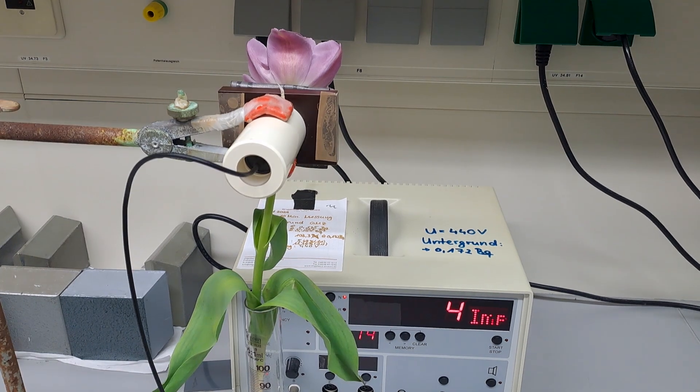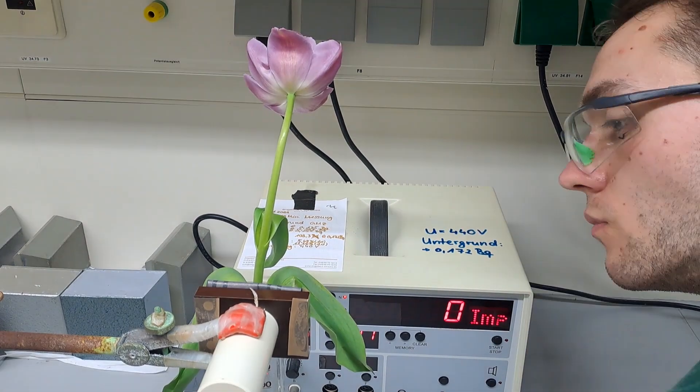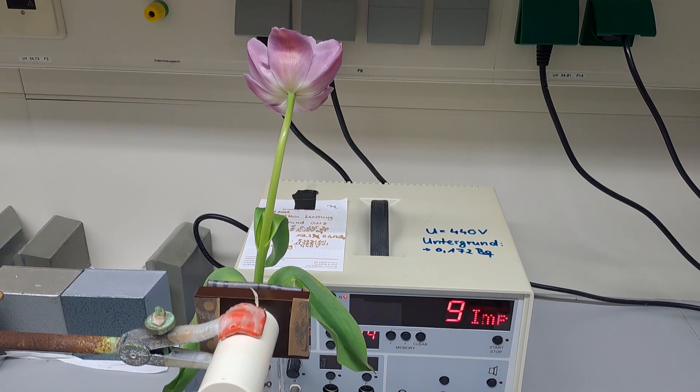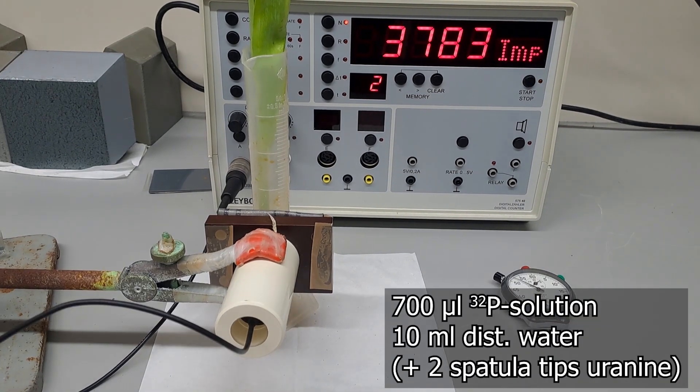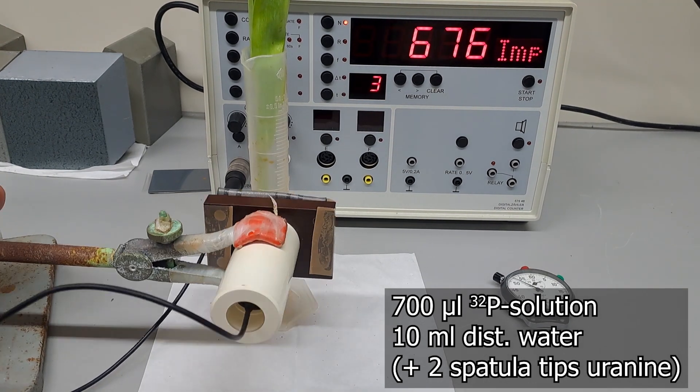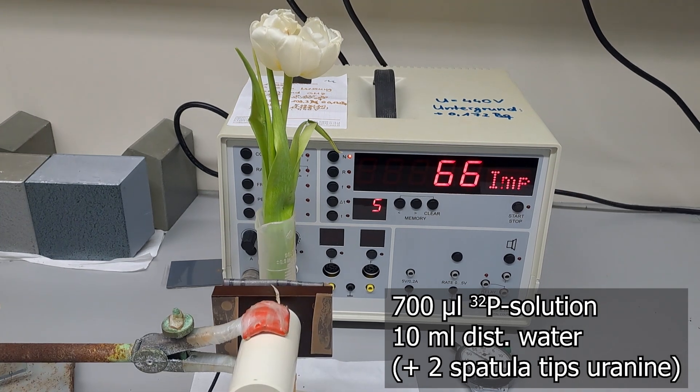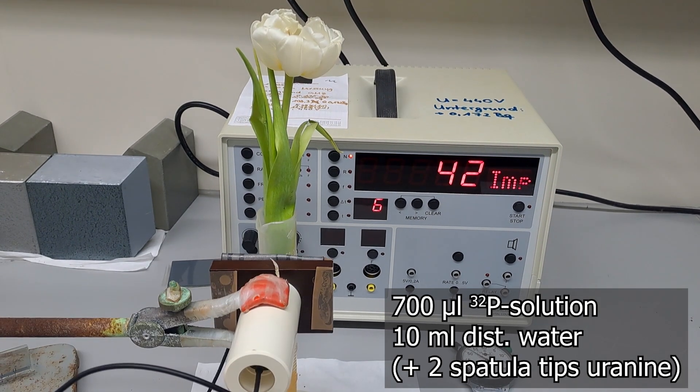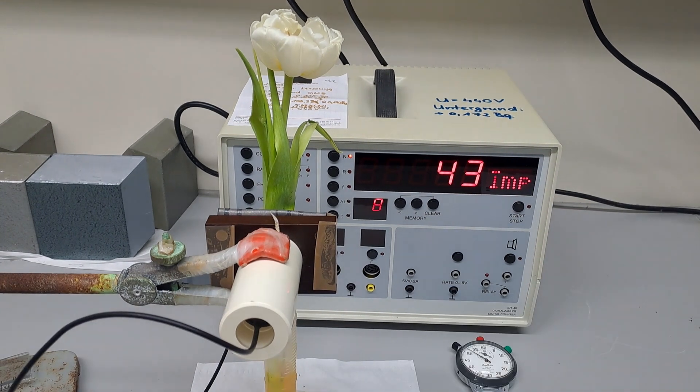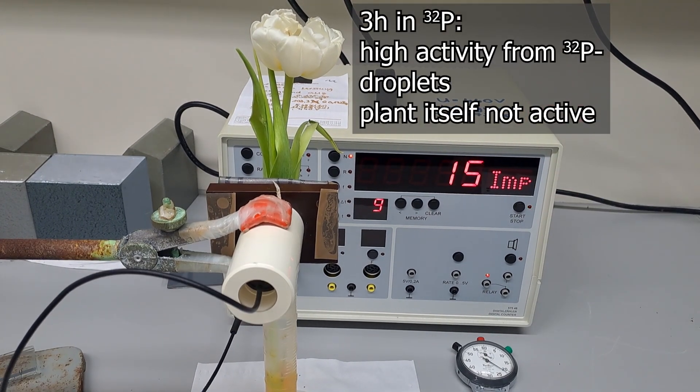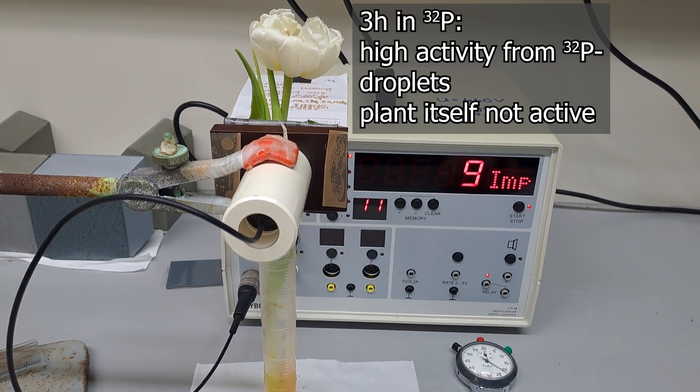There was no significant activity measured in the flower. The activity detected likely came from active droplets left on the inner wall of the cylinder. I tried again with a new flower and a much higher phosphorus-32 concentration: 700 microliters in 10 milliliters of water alongside two spatula tips of uranine, a fluorescent dye. We wanted to see what spreads more easily in the plant, but that didn't work out. Still had a nice effect for future experiments.